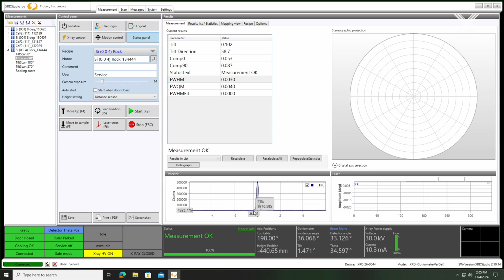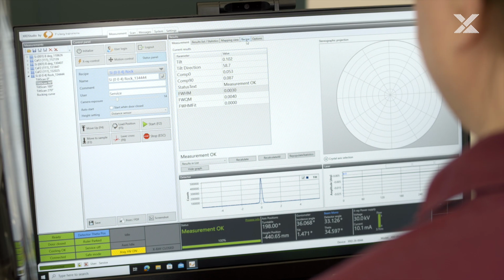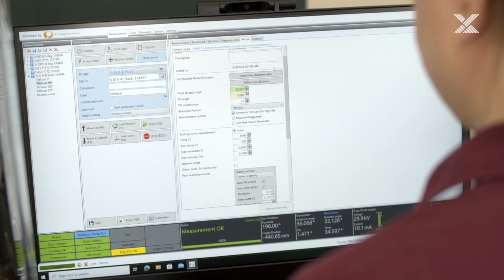You see that this is from 0.38 to 0.37, and these peaks are just much wider. They are good enough to find where the peak is, but not good enough to show anything about the crystal quality.